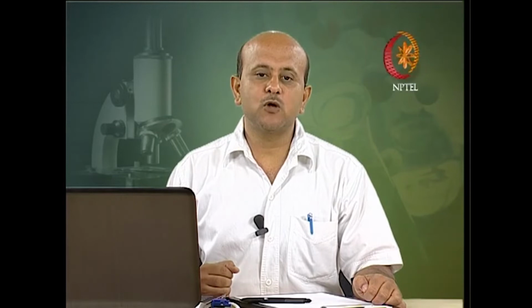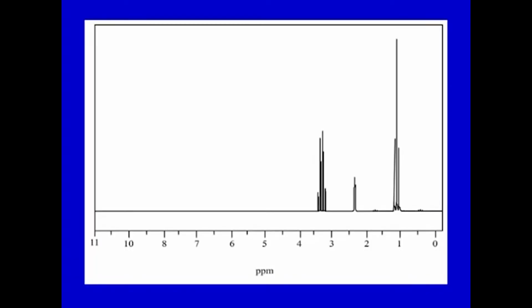Signals in a 1H NMR spectrum do not necessarily appear as a single line, because there is a splitting pattern, as we have seen, and this gives information as to how many hydrogens are present on the neighboring carbon. So, depending on the split, it will tell about the number of neighboring hydrogens, and also integration of the 1H NMR signal allows the number of hydrogens in each environment to be determined. If you see in this figure, depending on how many hydrogens there are, splitting of the peaks occurs, and that is determined as per the number of atoms attached to a particular group.